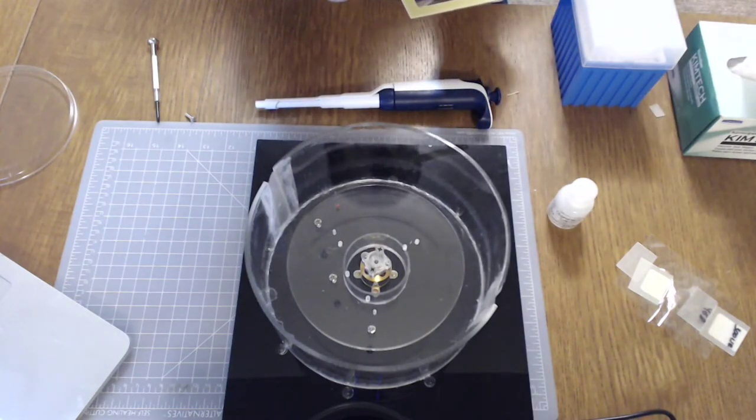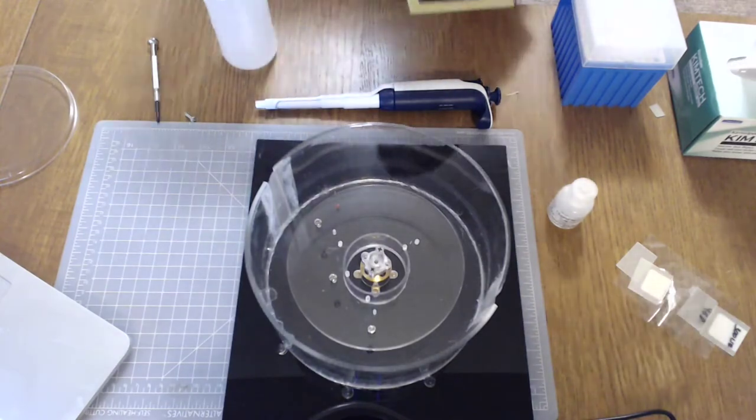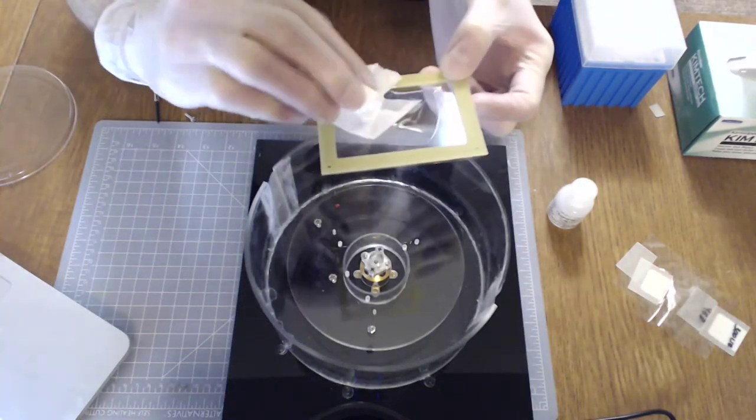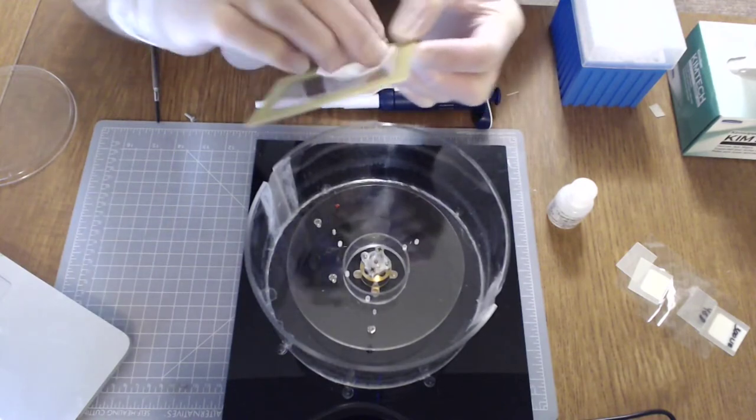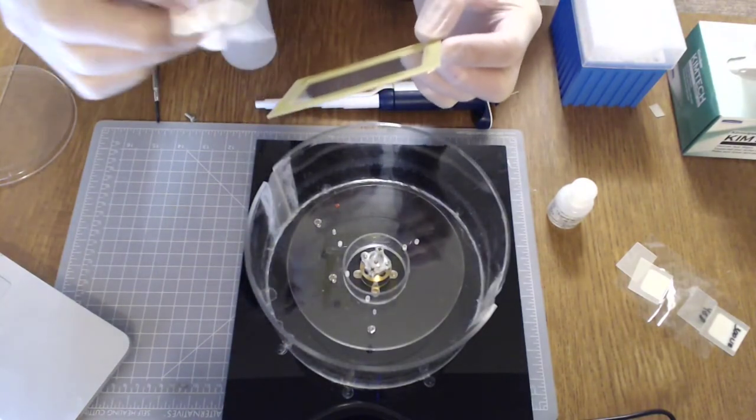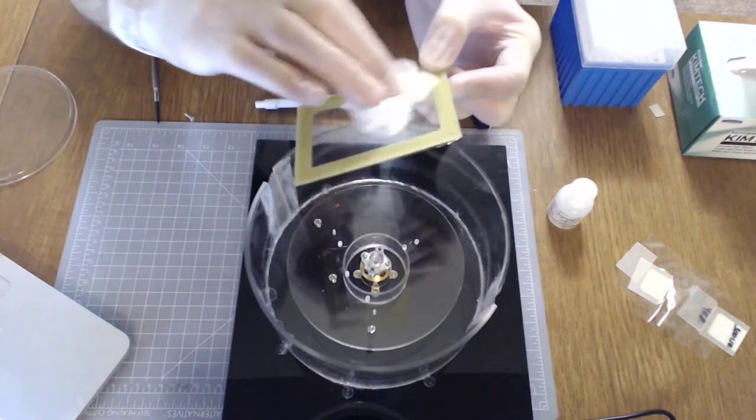So it gets the job done. Really all you need to spin coat these things is something that will hold it and spin at about a thousand rpm. I usually give it a quick cleaning with some IPA before spinning. If you have an ultrasonic bath that's a good way to do it as well.